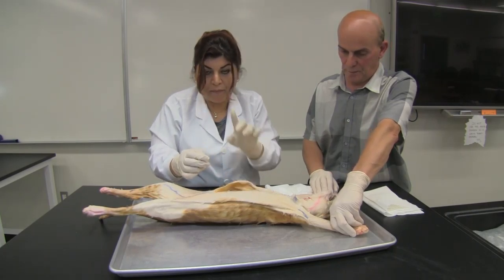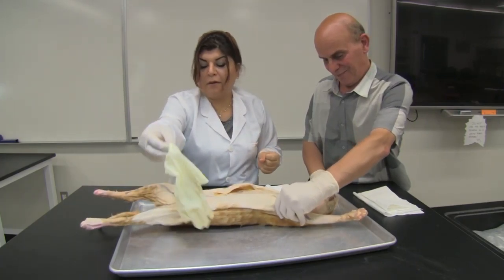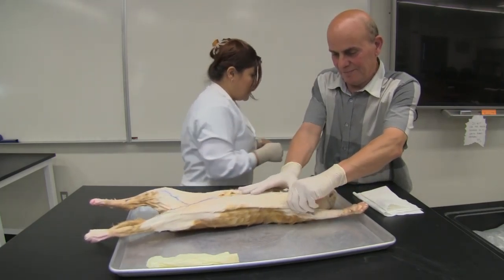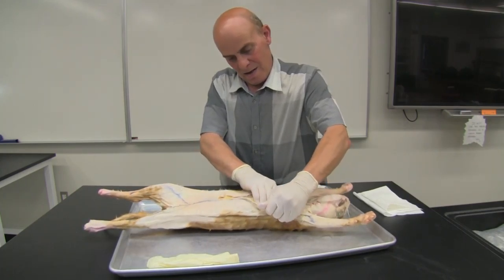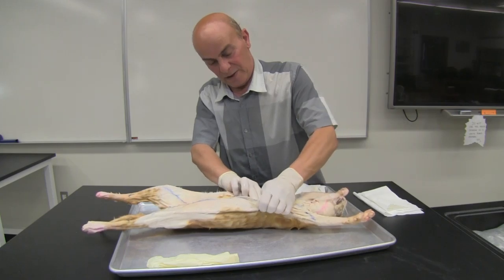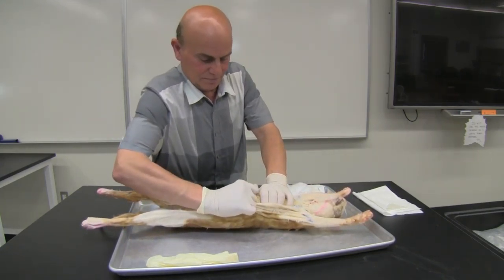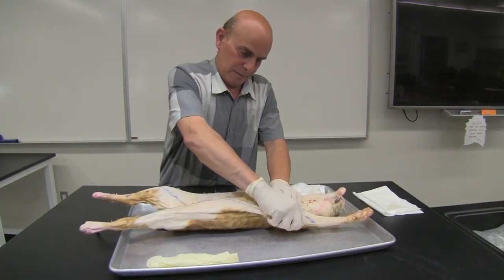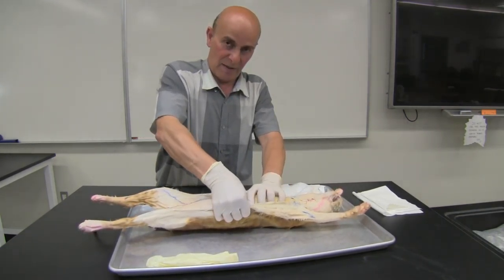Okay. I just made a hole in my glove. I will change it. Dr. Ahmad, could you please continue? Just separating the skin from the fascia. Using my fingers, not using too much of the scalpel.